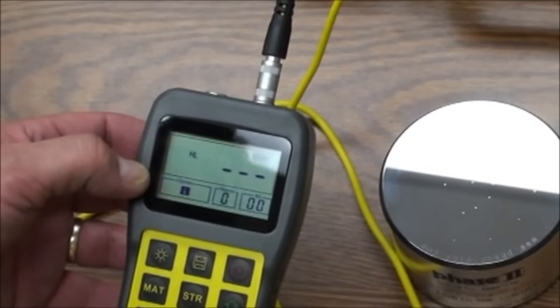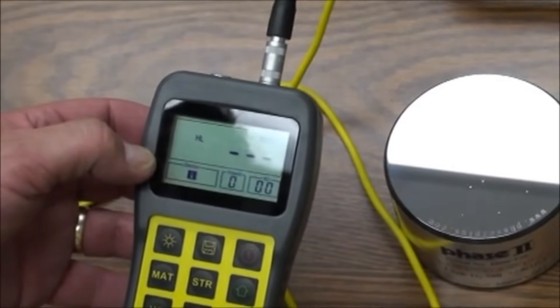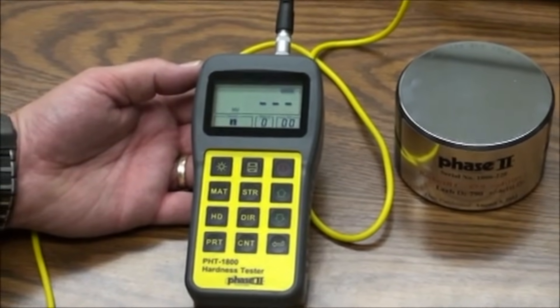Each indicator on the screen has a purpose. We will go over in detail the meaning of each and how to make any changes if necessary. Let's begin with material setting.